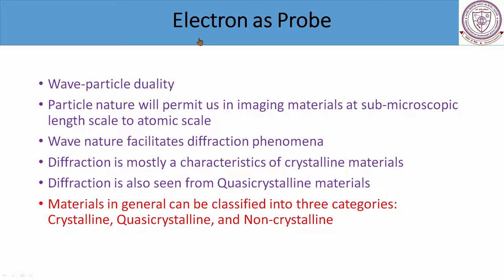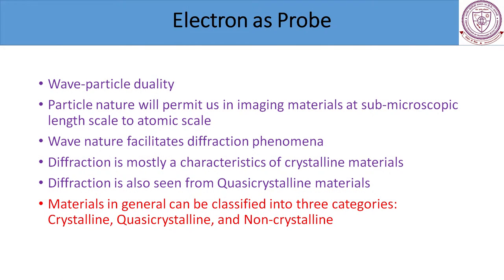That particle nature will permit us to image the material at different length scales. And those length scales are basically submicroscopic to atomic scale. That's the brilliance of using electron as a probe. Wave nature of electron shall facilitate diffraction phenomena.